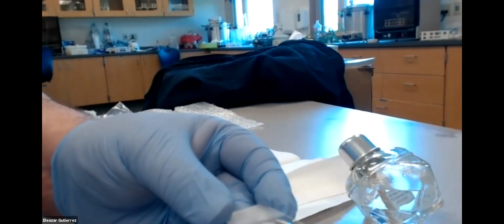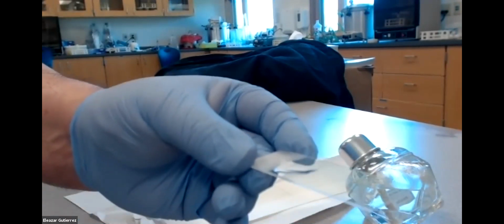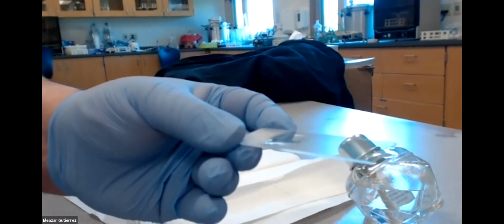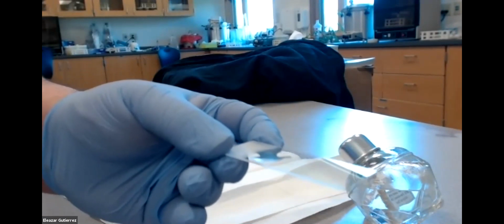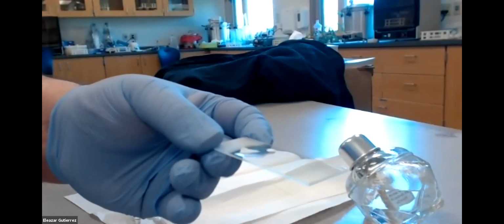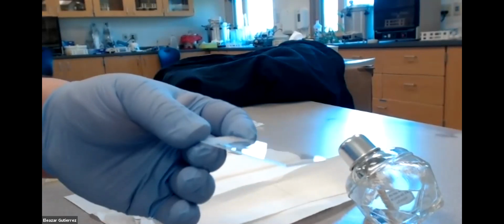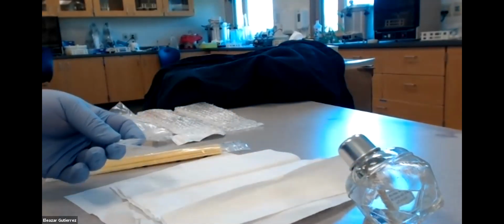And it appears that we have a catalase negative organism here. So no bubbles. The bubbles that come out would indicate a catalase positive organism. And this doesn't have to do so much with metabolism. So even if it's an older culture, it'll work because catalase is an enzyme that's manufactured as a protection by the organism. But no bubbles, so catalase negative for this one.